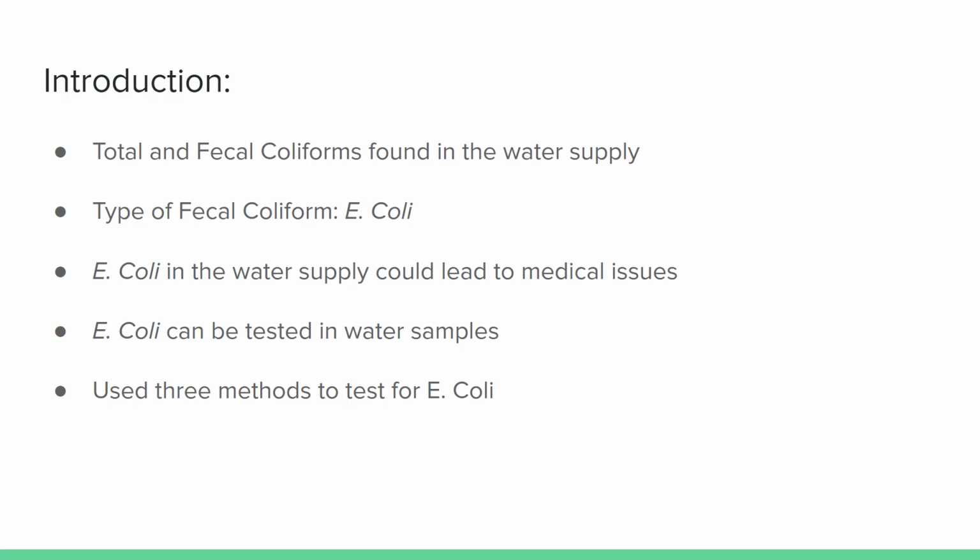What has been done by my professor, Joseph Frenzel, and myself is use and compare 3 methods for E. coli.